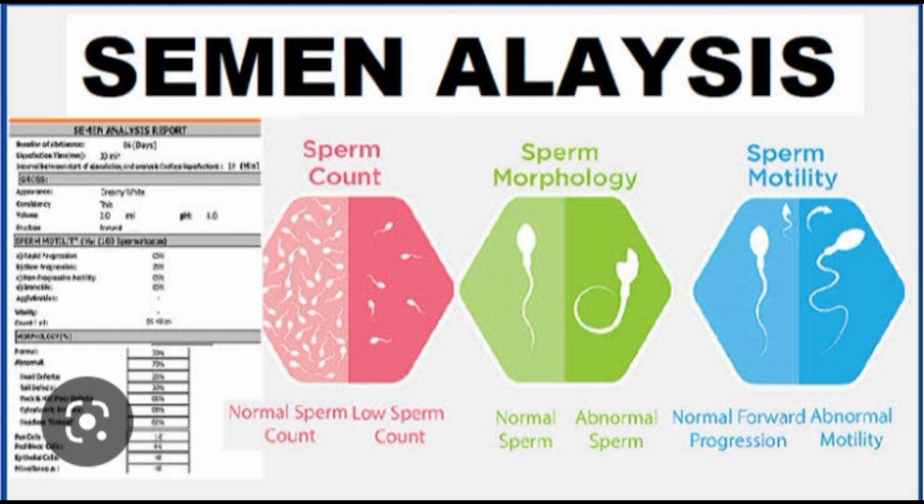Count the number of spermatozoa in the microscopic field. The same field is searched for immature forms of spermatozoa. Examine 100 to 150 spermatozoa for the following abnormalities. Head too large or too small, pointed, ragged edges, atypical distribution of chromatin, presence of acidophilic vacuole, double-headed.